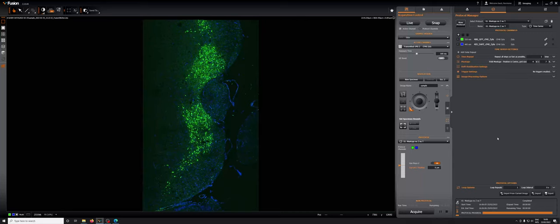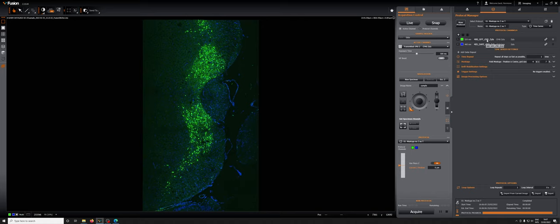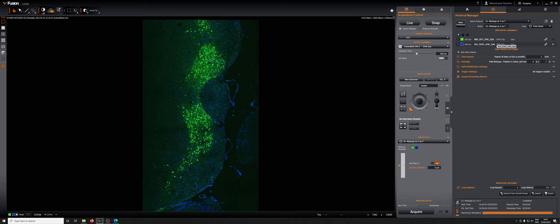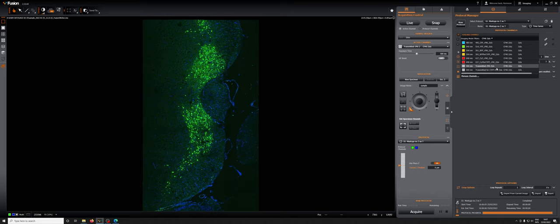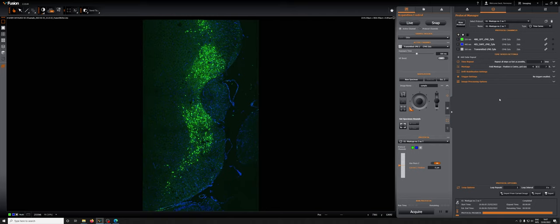In this video I'm going to explain how to add a transmitted light channel to a multi-dimensional channel acquisition. In this case I've already populated a montage without Z or T protocol with a GFP on the CF40 Xyla and a DAPI channel on the CF40 Xyla. I'm going to add from the same family, CF40 Xyla, the transmitted channel to this protocol. If I were doing CFP and YFP I would add this one, since I'm not I'm going to add this channel here.